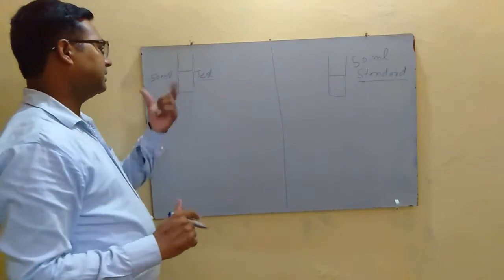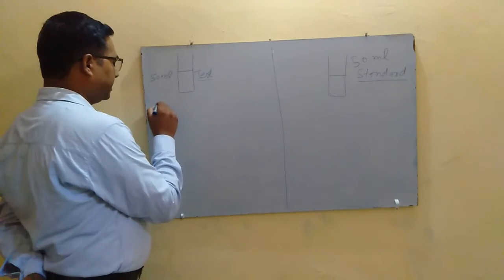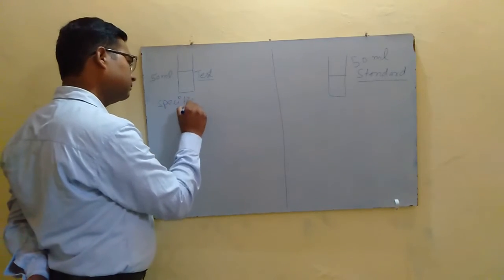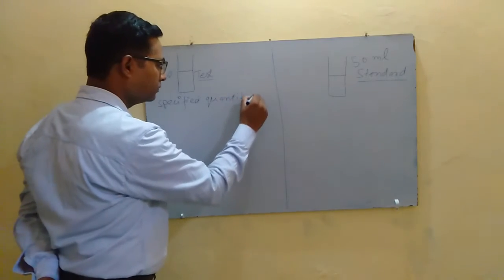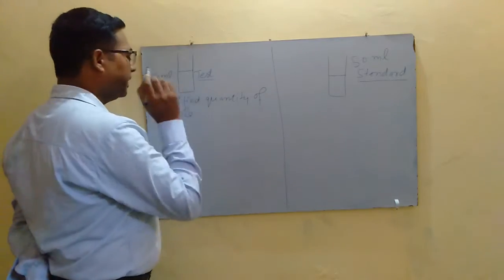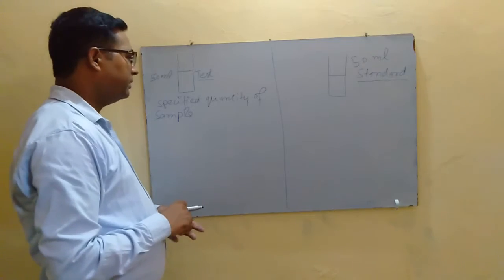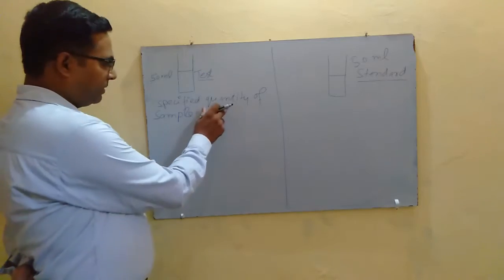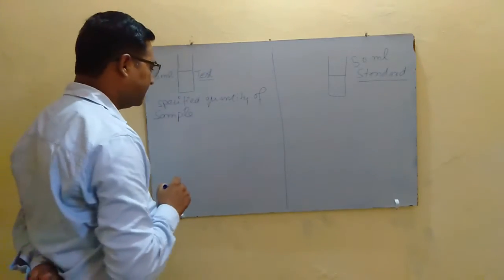In the test Nessler cylinder, we add a specified quantity of sample dissolved in water, or as prescribed for a particular substance in the pharmacopoeia.